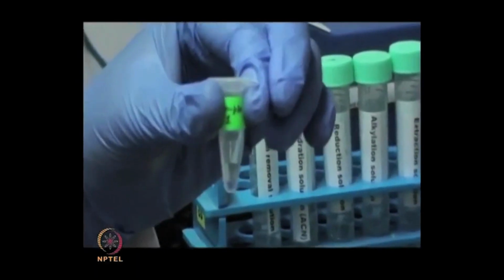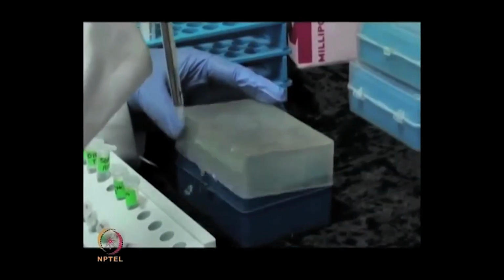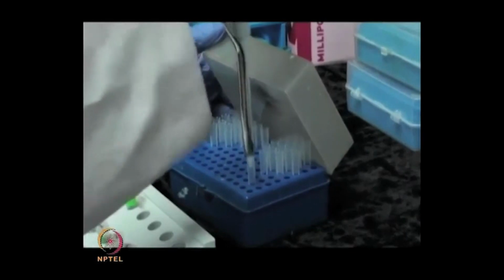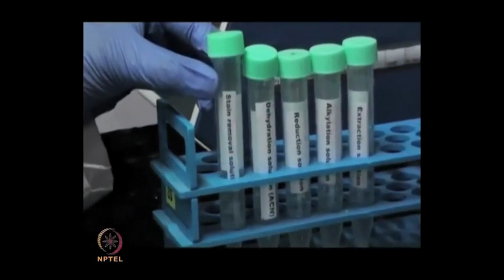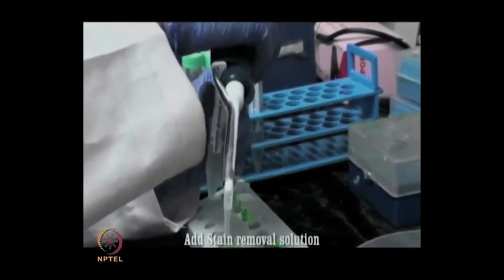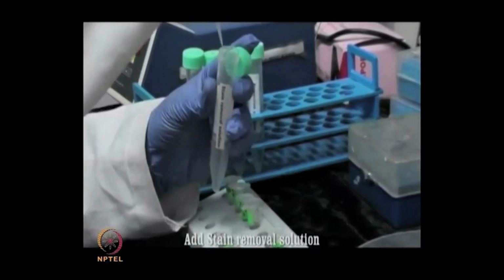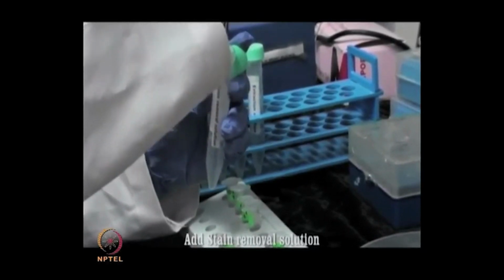Now, you can add 50 to 100 microliters of stain removal solution. For the large gel pieces, take enough liquid to cover them completely. So, you can adjust the volume depending on the size of your spots or the band.